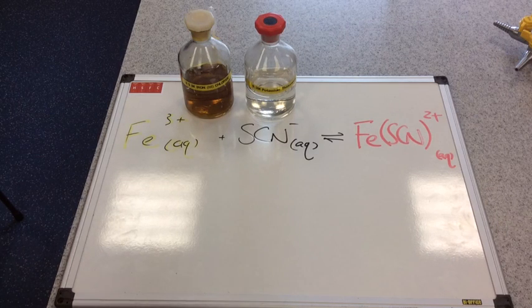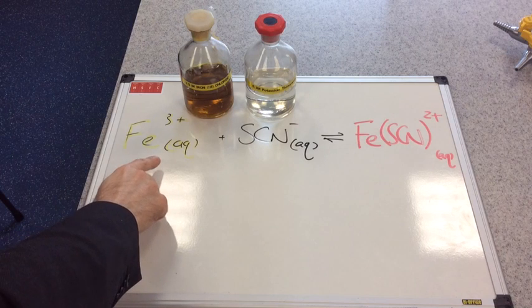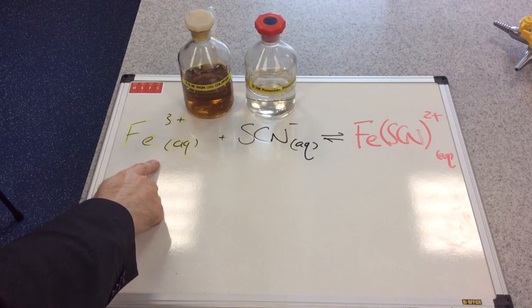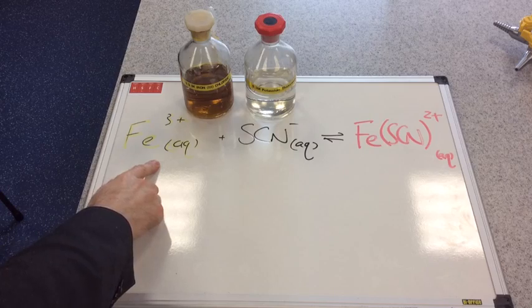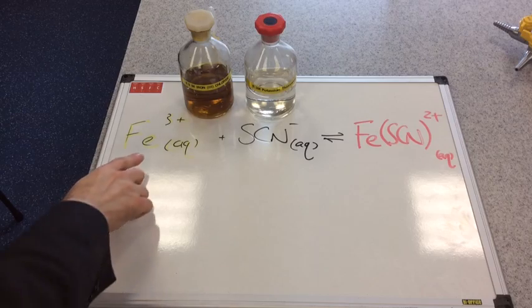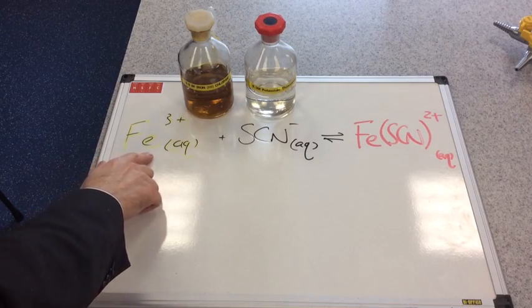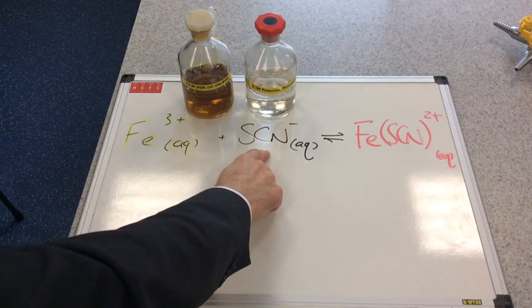In this video I'm going to look at the equilibrium or dynamic equilibrium that exists when you add together a source of iron 3 plus ions in aqueous solution. From the bottle label, I'm going to use iron 3 chloride that contains iron 3 plus ions and I'm going to add that to a source of thiocyanate ions, so I'm using potassium thiocyanate.